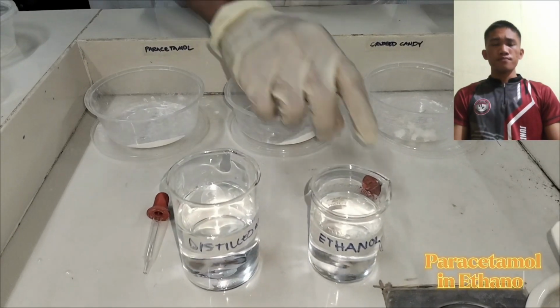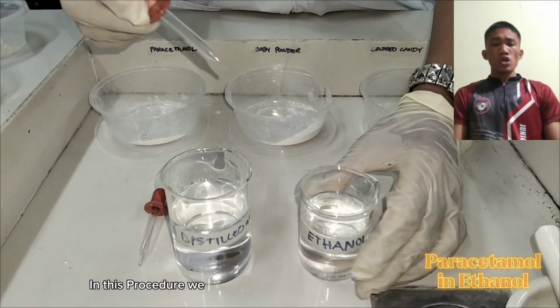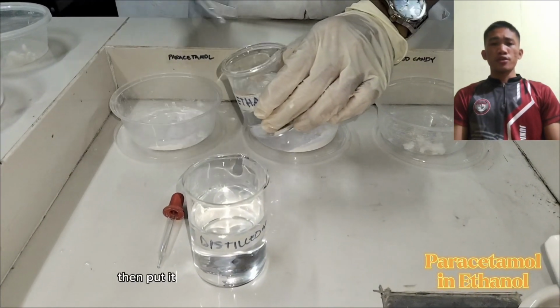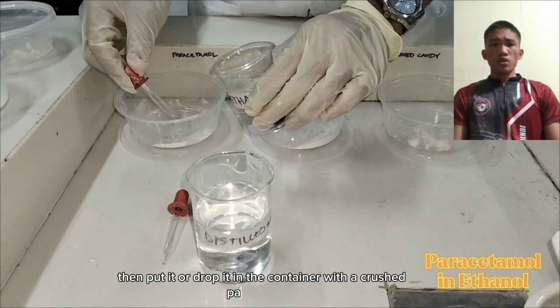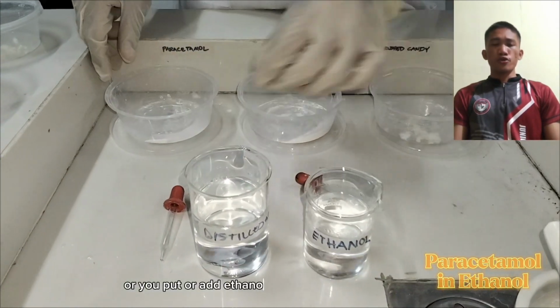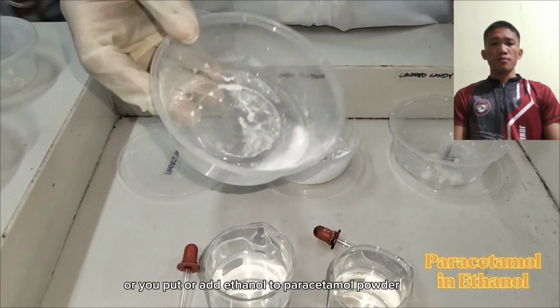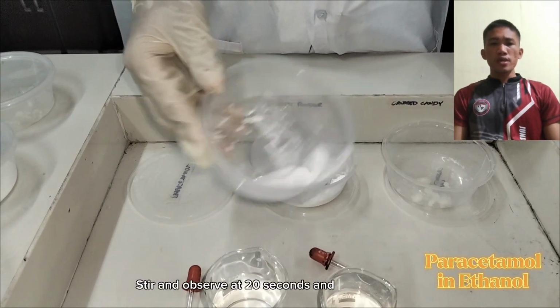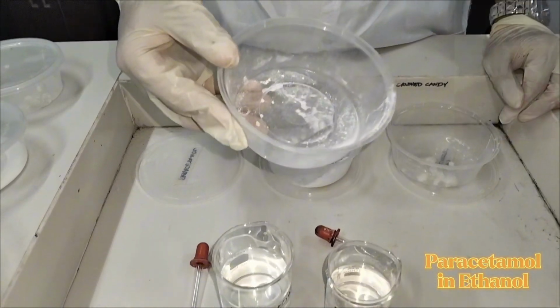Paracetamol and ethanol. In this procedure, we need a dropper to get some ethanol and then drop it in the container with a crushed paracetamol, or you add ethanol to paracetamol powder. Stir and observe at 20 seconds and 1 minute.